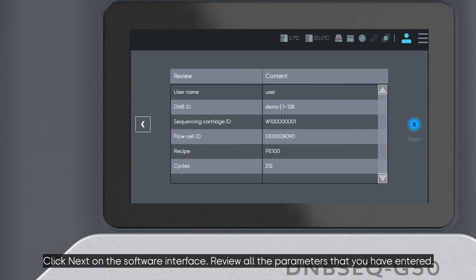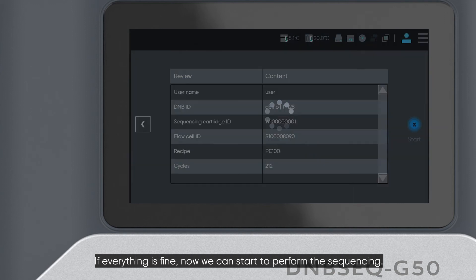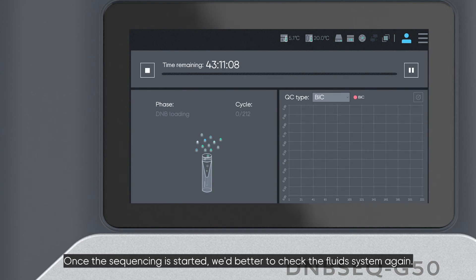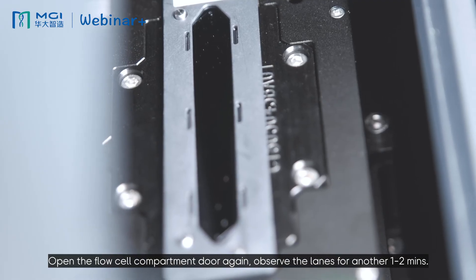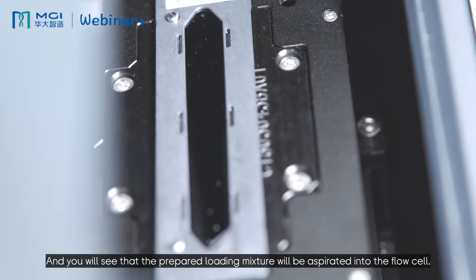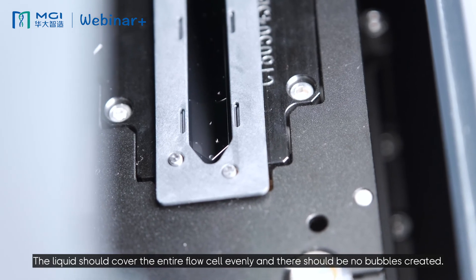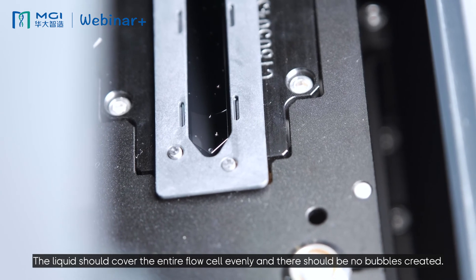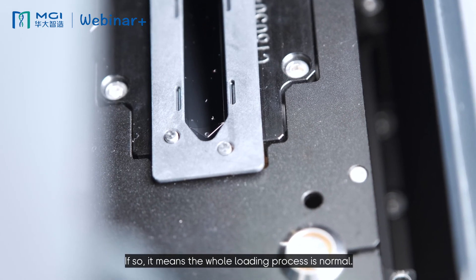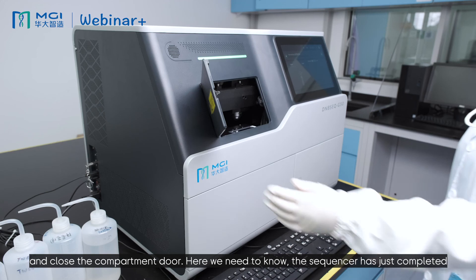Click Next on the software interface and review all the parameters you have entered. If everything is fine, we can start to perform the sequencing. Once the sequencing is started, check the fluidic system again — open the flow cell compartment door and observe for 1 to 2 minutes. You will see the prepared loading mixture being aspirated into the flow cell. The liquid should cover the entire flow cell evenly with no bubbles, which means the loading process is normal. Then use a dust remover on the flow cell surface and close the compartment door.